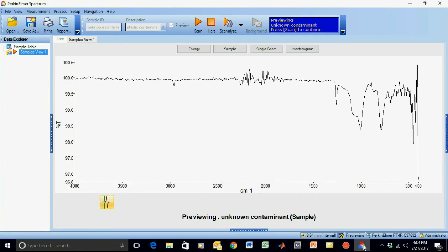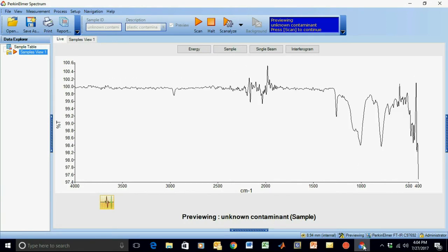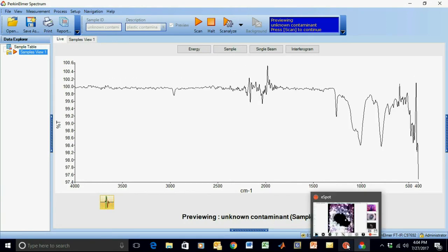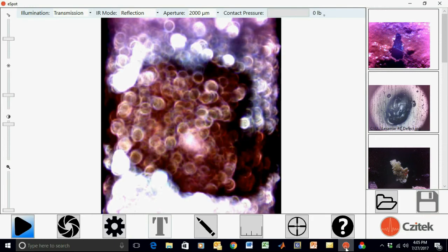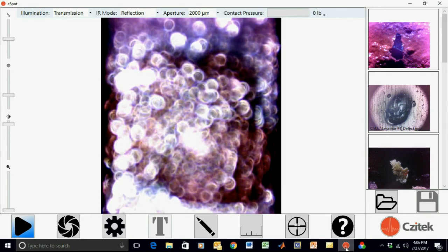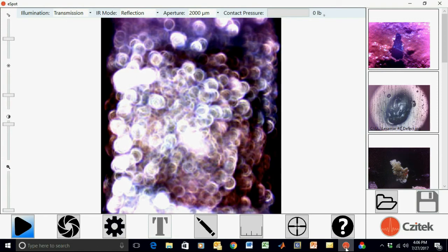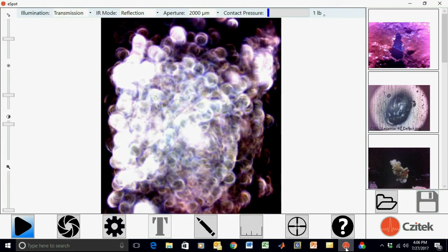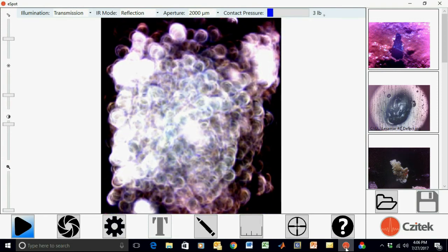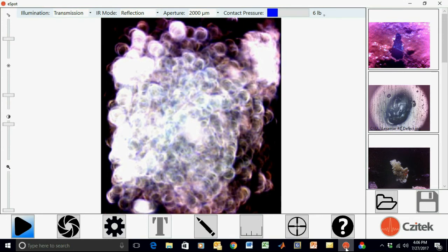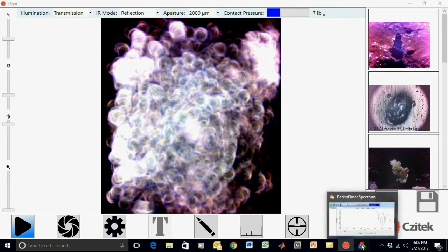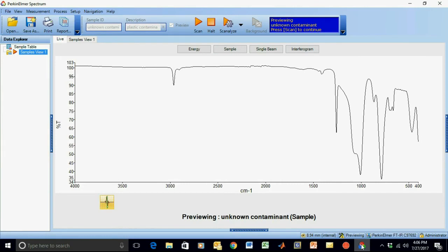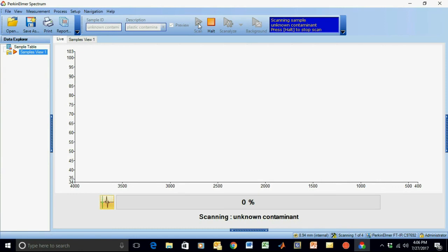Using preview scan, we monitor the degree of contact by the infrared band depth. We continue to apply force to the sample while monitoring the contact using eSpot video microscopy software. A pressure readout progress bar is displayed in the upper right-hand corner of eSpot software, letting you know when optimum pressure is obtained. When maximum infrared band depths are observed, we're ready to collect the spectrum.